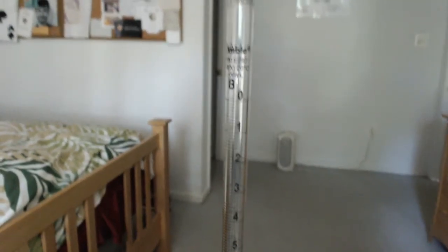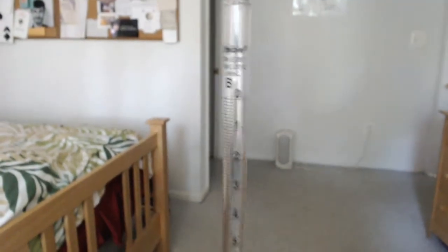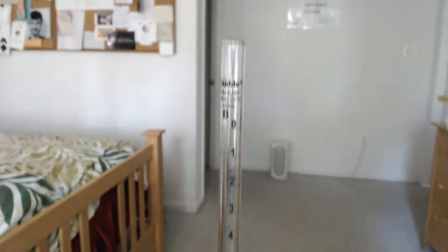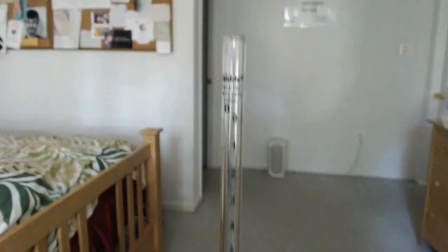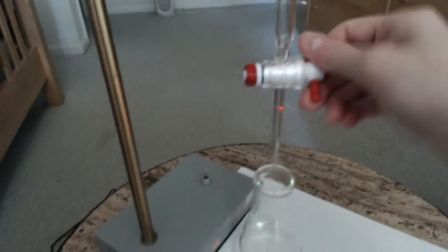Okay, so what I have here is called a Buret. You'll notice it's kind of like a glass cylinder, but at the top it has a 0 and it counts down from there. If I zoom out a bit, manual zoom, you'll see that this long cylinder actually at the bottom has a little valve. If I open and close this valve, like so, by twisting this knob, then water will drip out, or whatever's contained inside the Buret will drip out at the bottom. So I'm going to close that for now.